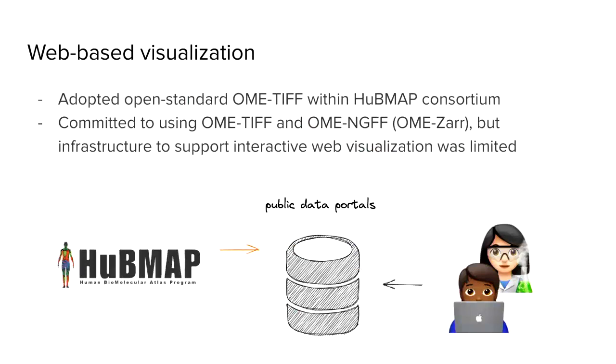So bringing this now into the context of the work that I have been doing in the Gehlenborg lab, as we were deciding on these different imaging formats, I was involved in the design of the NGFF specification, but also in tandem with trying to build visualizations to support these open standard formats in a more direct manner on the web.